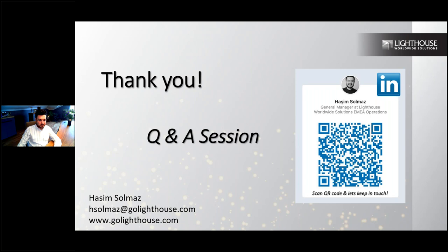What particle counter sample size shall be collected during qualification for both at rest and in operation sets in class ABCD? Okay, so Mr. Mohammed Ismail was asking about the particle counter sample size and the volume, which we described in the last section. One thing I should mention, if you say class A, B, C, D, that's not a relevant definition. If it's ISO, it's ISO class 1 to 9. If it's GMP, it's grade A to D. So using the right terminology is critical for defining limits. But I think we already answered this question during the session.